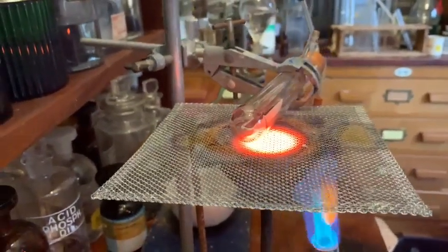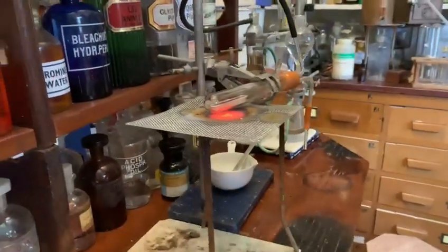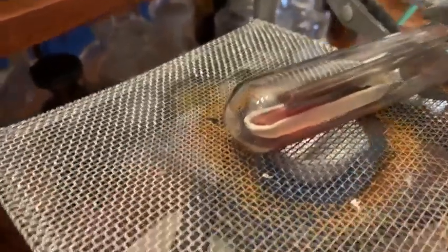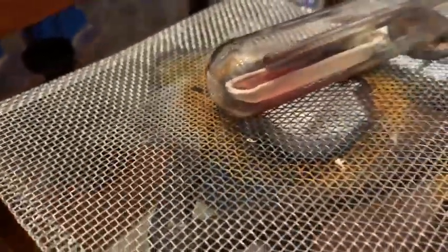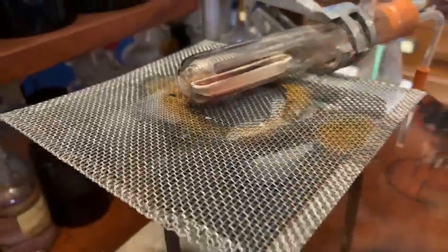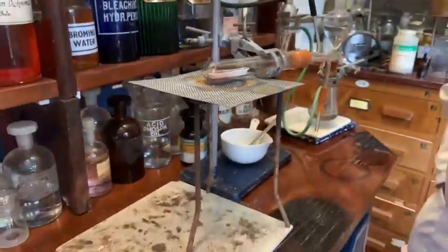Let me just take the Bunsen burner out of the way so that we can see. Yes, there's definitely a reddish colour — a reddish copper colour there in the combustion tube. I nearly burned my finger touching it, so I'll try not to do that. So that's all for today, and next time we're going to be mixing that with some ethyl iodide to produce some zinc ethyl.